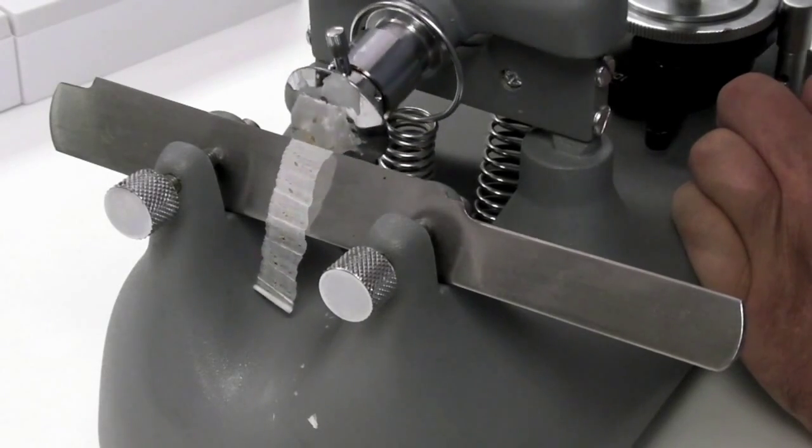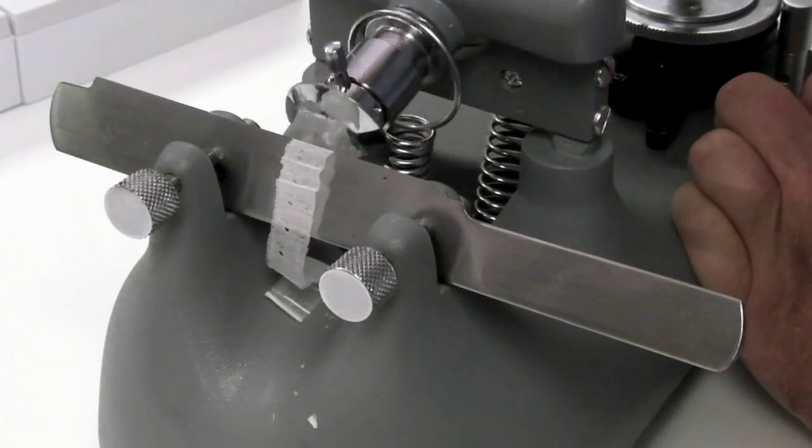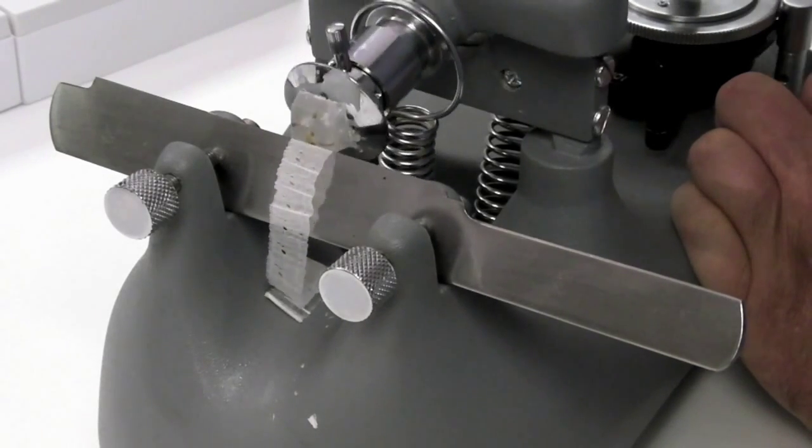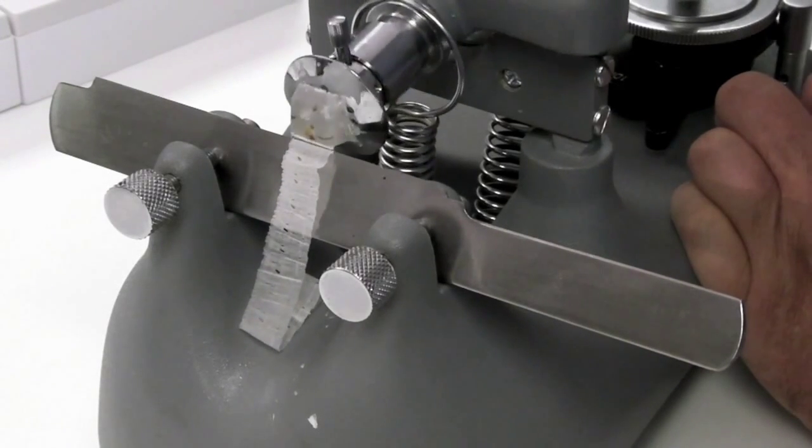The Brunel rocker is an ideal microtome for ribboning sections, and here you can see that just by keeping a rhythm going, sections can be cut as a ribbon.